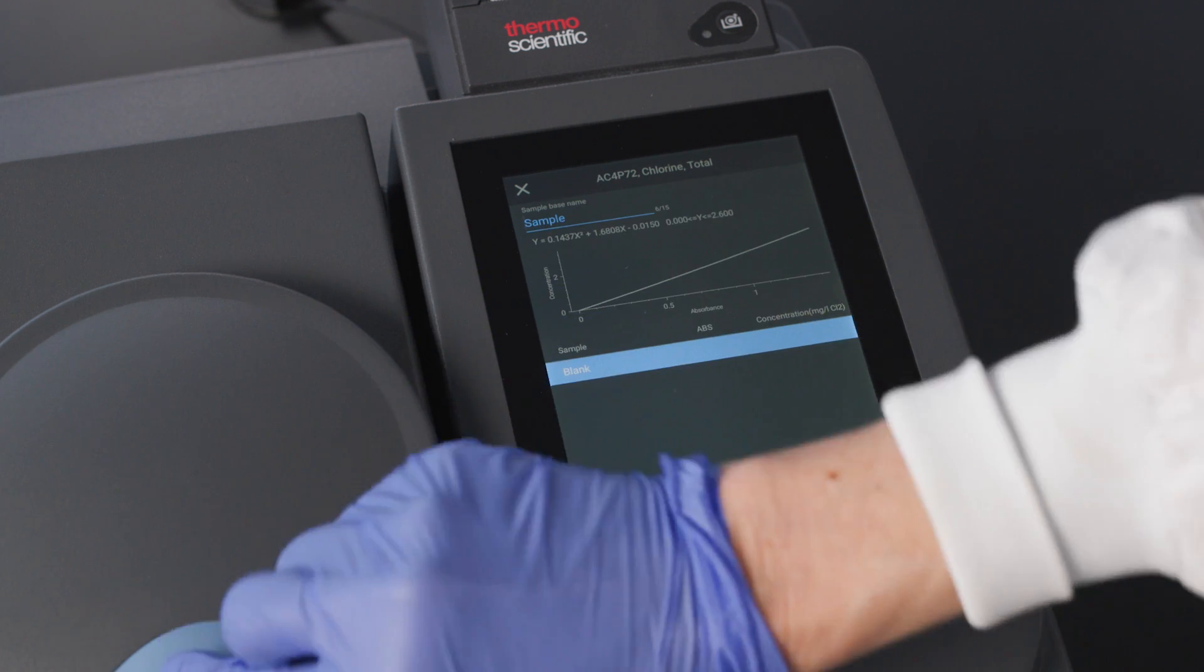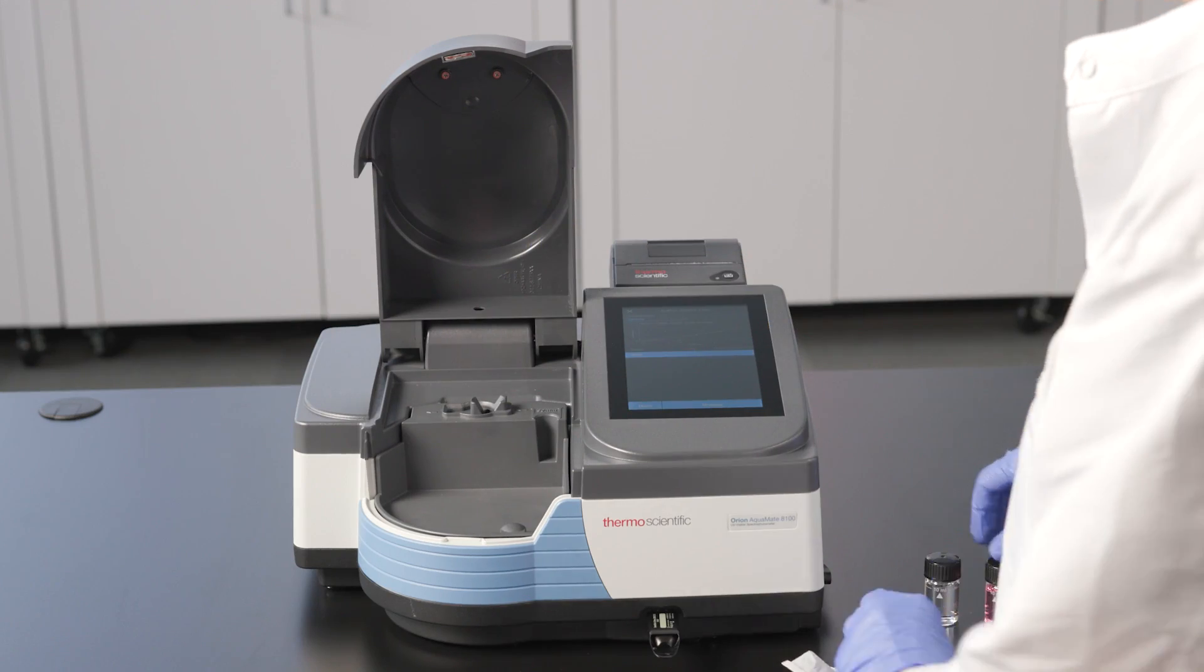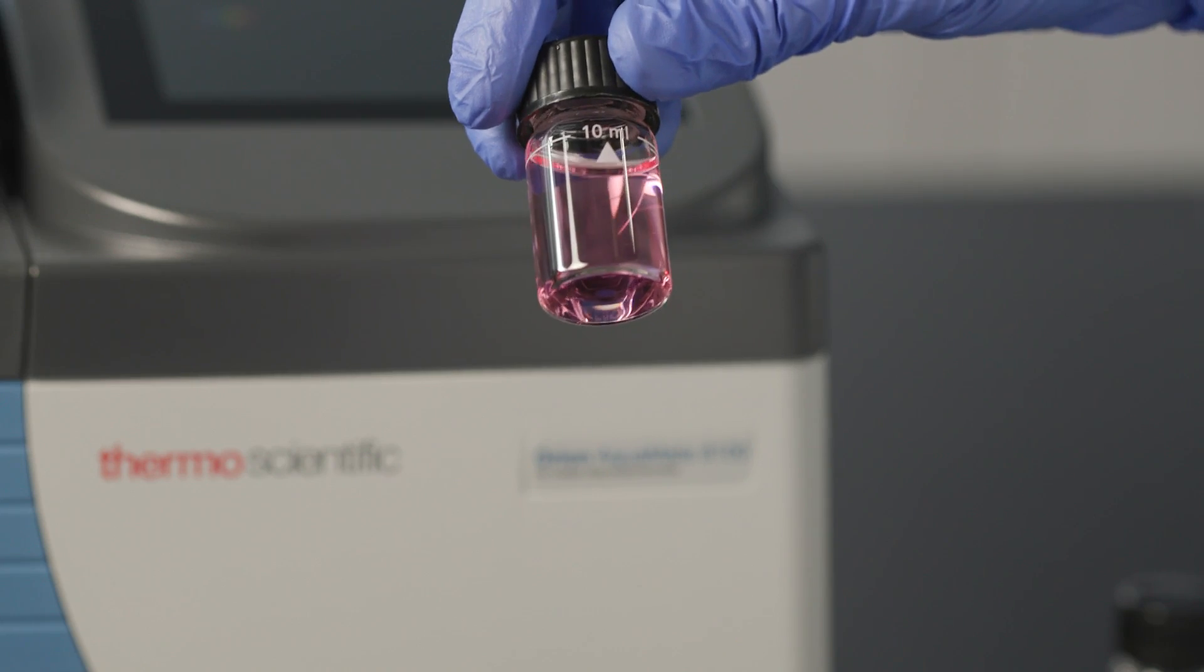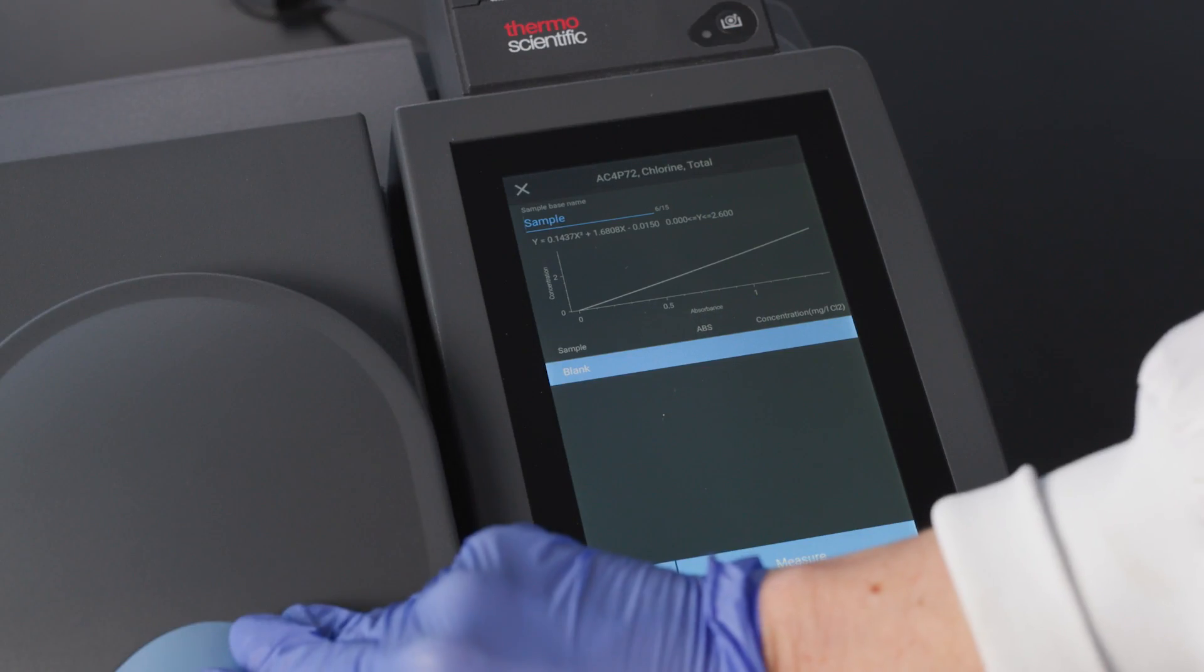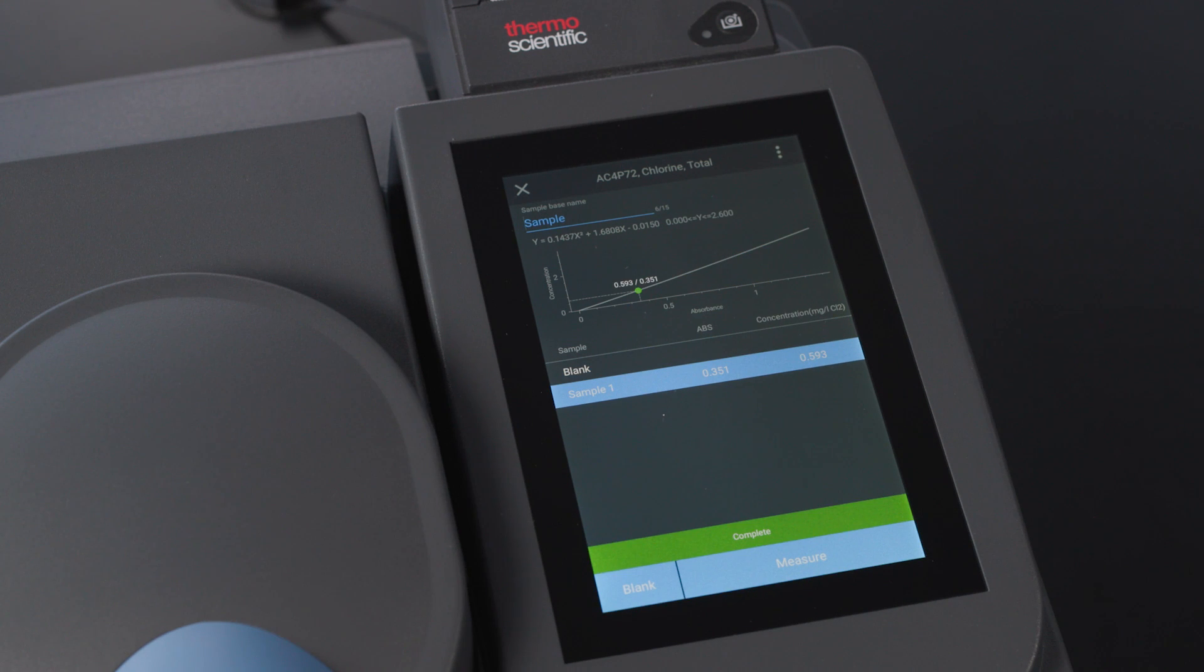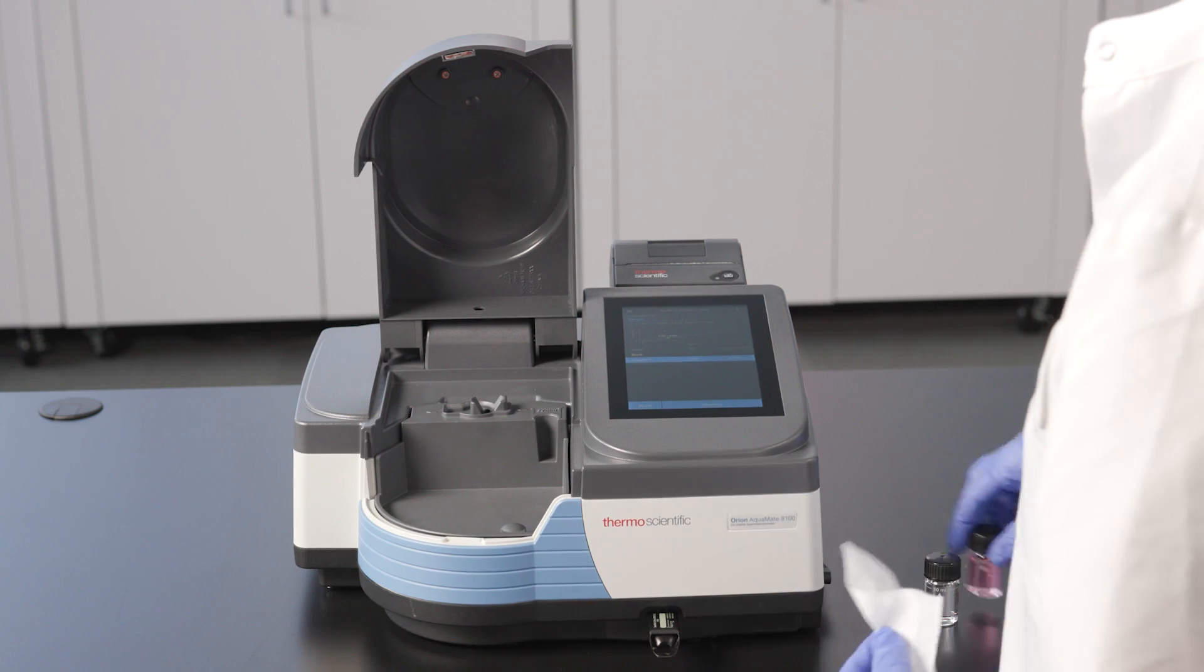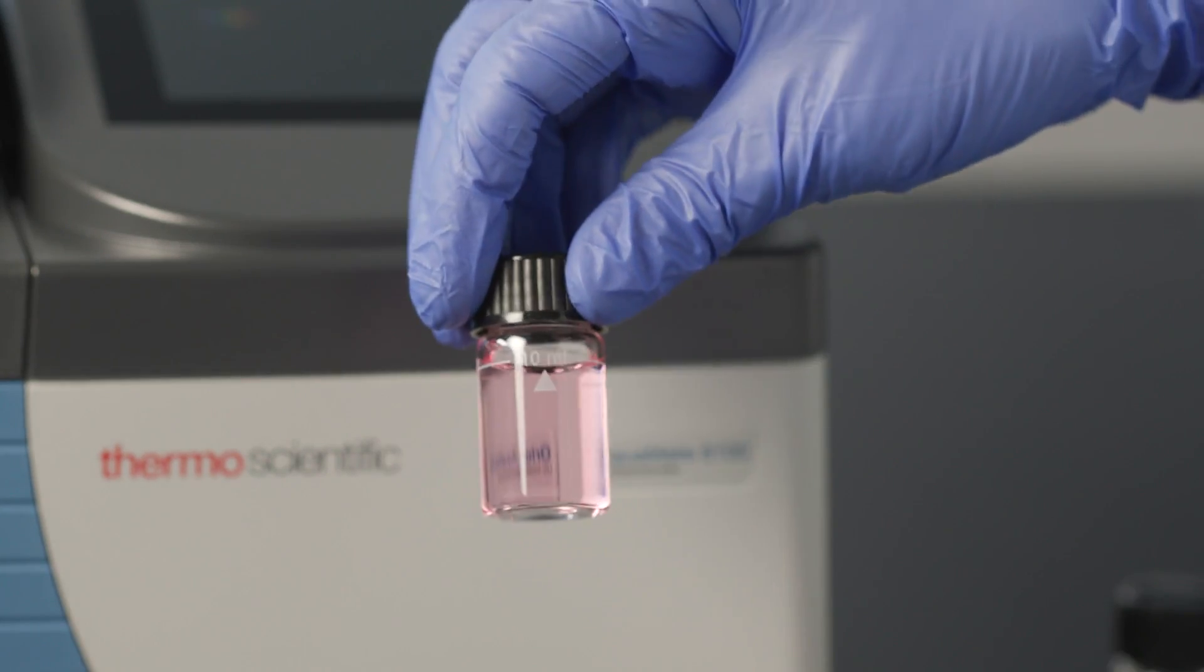Now we can move to the measurements. We take out the blank and insert our first sample. We can enter the sample number here if we want, or the meter will assign sequential sample numbers. Then we simply select measure, and the Aquamate spectrophotometer will tell us how much chlorine is in the sample. Then we can repeat the process for other samples by simply changing the sample in the holder and pressing measure again.